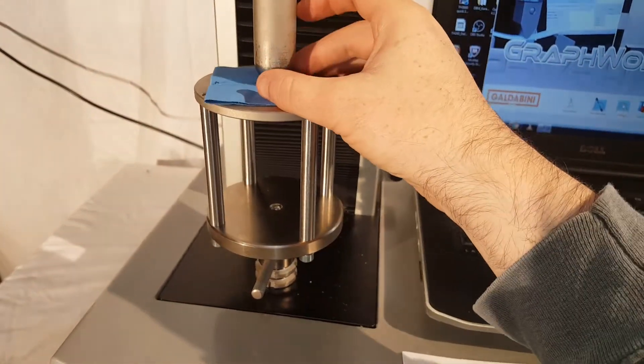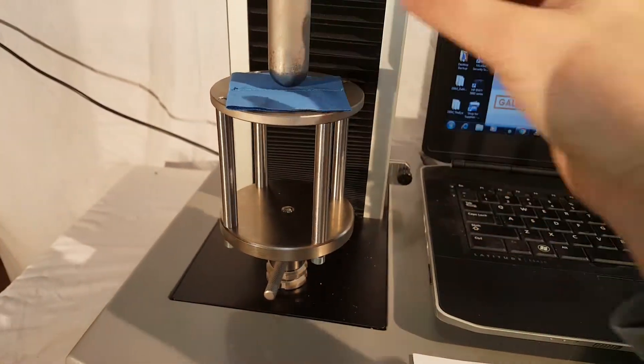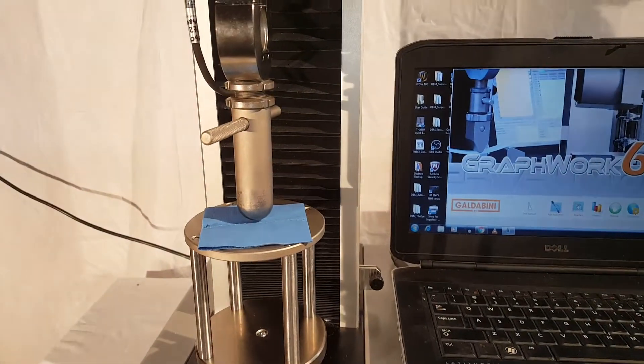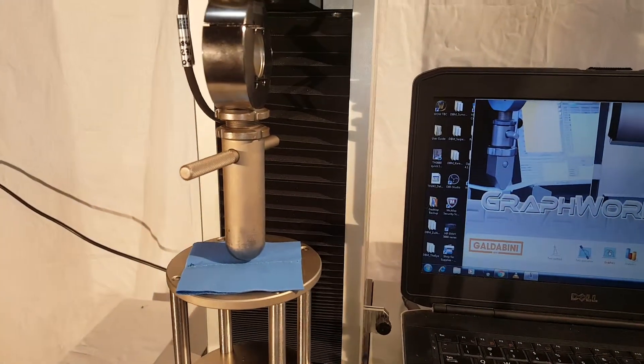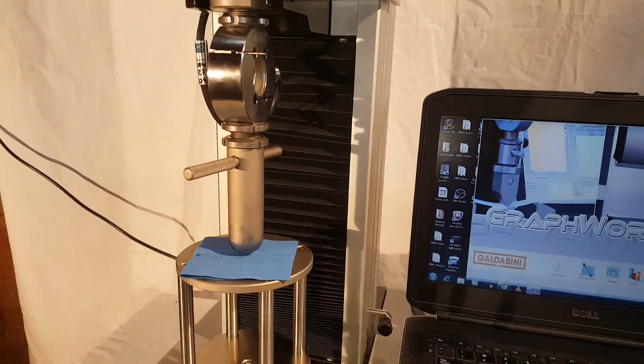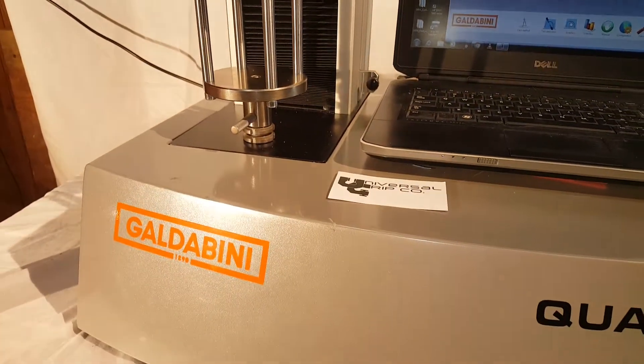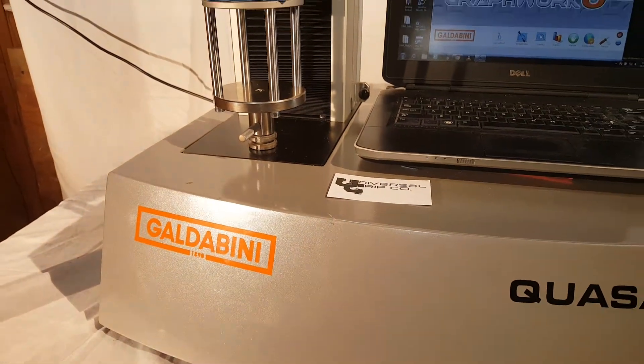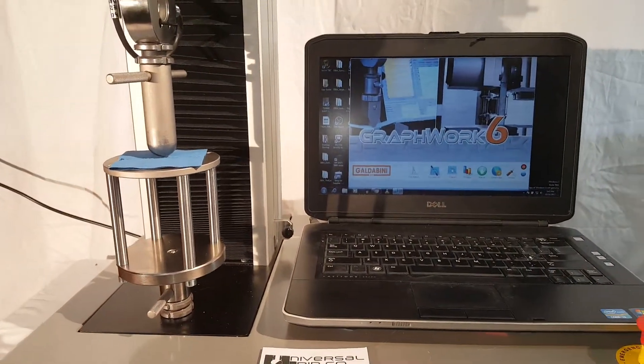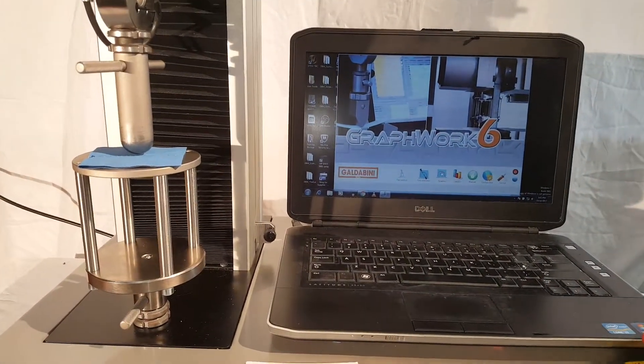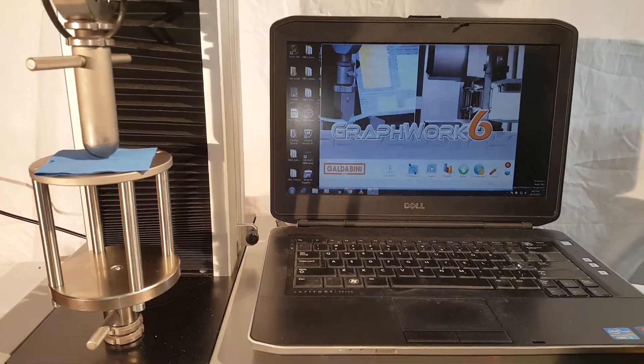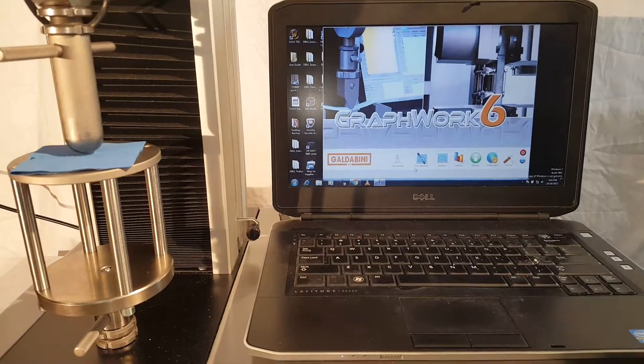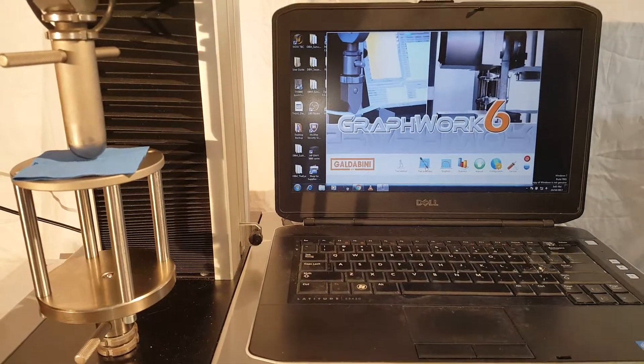This fixture can attach onto any universal testing machine by means of a clevis pin style adapter. Today we're using our Galdabini machine. This is a real flexible and easy to use universal testing machine. I've already set up a test method.